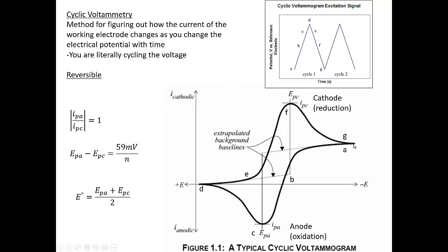And so it starts out where maybe you're at a voltage of 0, and then you're slowly increasing your voltage. So you're going from a 0 potential to a positive. And what's happening is you're not having really any changes in current, no changes in current. Ooh, now all of a sudden I have a huge change in current, and it's going back to where it started. And then you're cycling back, you're going back to where you started from as far as voltage goes. So now voltage is changing, it's going back to where it started, and we're here.